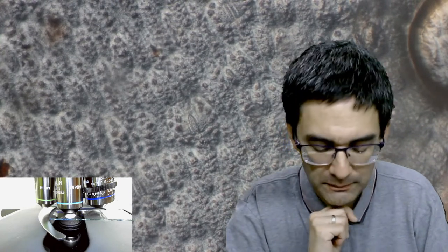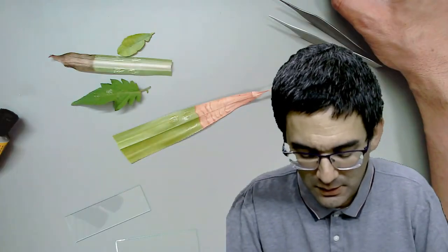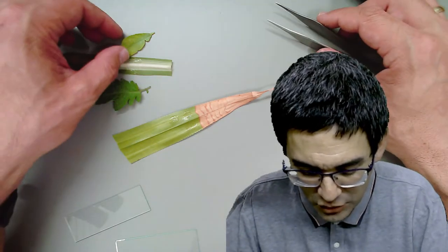I've got a 60 times objective but it might not work because it's not entirely flat and the working distance is so small - it might push it to the side. Yeah, it pushed it to the side. Here you can see it a little bit better all the way in the corner - there are plenty of these stomata. So let's have a look at another one.